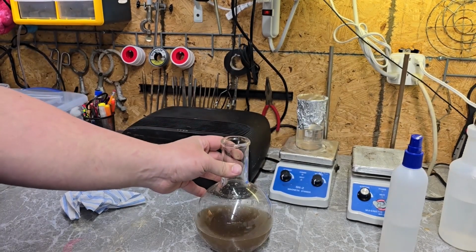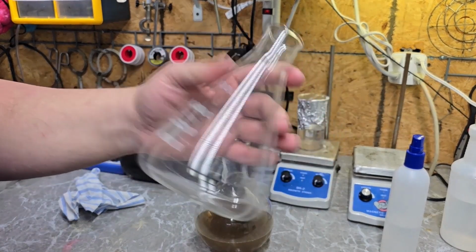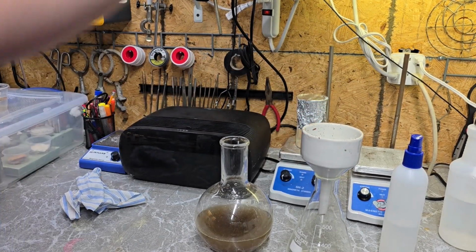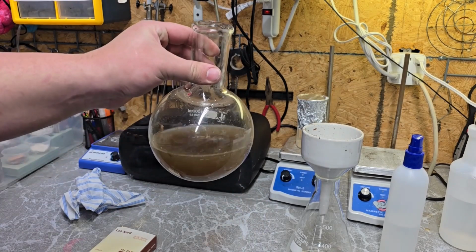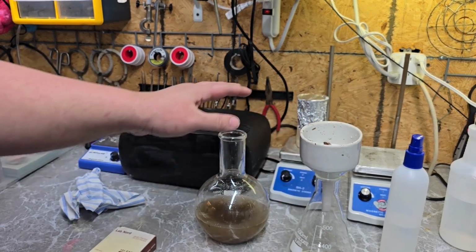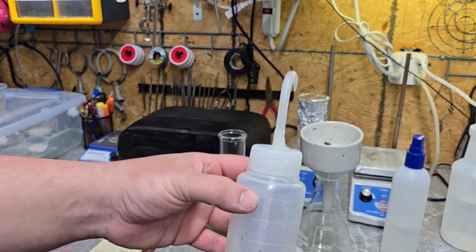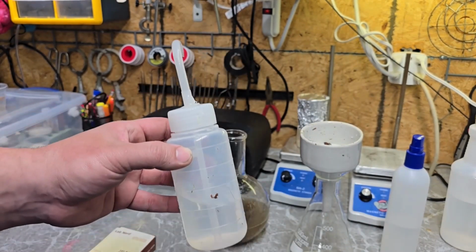I'm going to take the Buchner funnel that I used and put that into a 500 milliliter regular Erlenmeyer flask that has a dead bug in it, and now it doesn't. Take the Buchner funnel. You can see that it's dirty. I'm going to wash that out before I do this. But then I'm going to put the Buchner funnel in there, take some of the qualitative filter paper that I have, put it in the Buchner funnel, and filter about half of this through this filter paper. That way hopefully a lot of the little critters in the water will get stuck to that filter paper, and then I can peel it off and spray some of that down with some distilled water into another beaker, and then I'll have a concentrated solution of whatever little critters will hopefully be in solution.